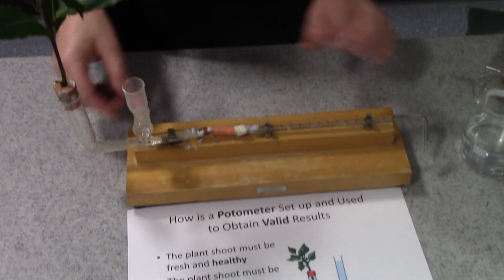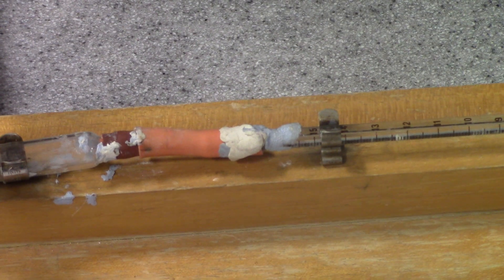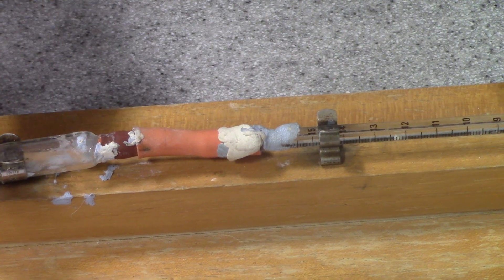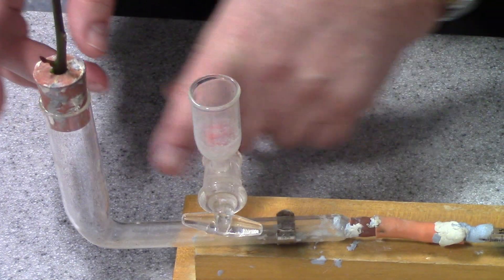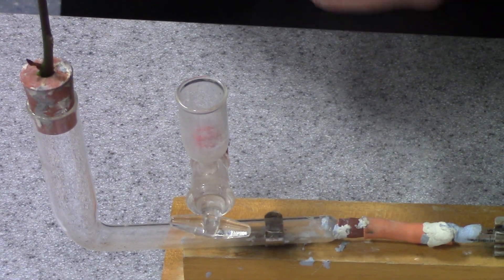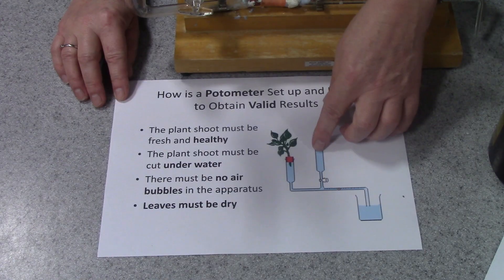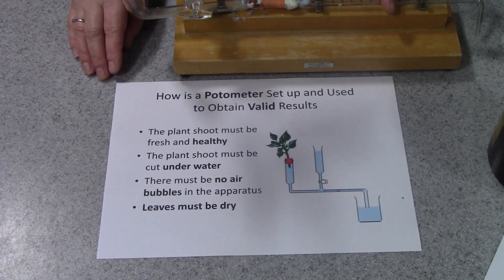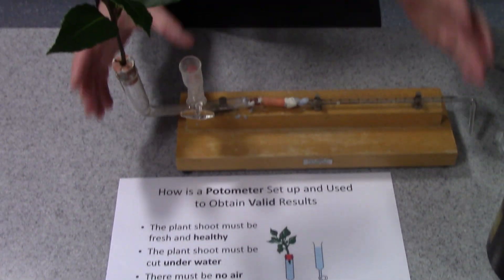Another thing about this apparatus — you can see all these bits of blue tack and putty that have been put on over the years — you have to make sure the whole thing is airtight. Where the shoot is inserted, you need to seal around it very carefully with Vaseline to make sure that when the water has been drawn up through the plant, there's no air being drawn in from outside. Once you've finished a run of this investigation, you can open a tap or use your syringe to refill — in other words, to push the bubble back to the beginning. So that, in its simple form, is a potometer.